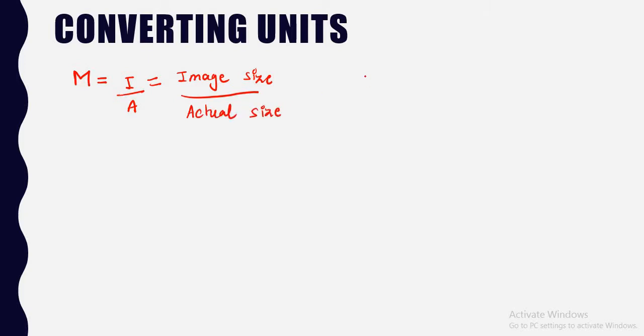How I ask my students to remember it is as IM, a simple way. And then you can rearrange it, like how we have rearranged for magnification. In a similar way you can rearrange for the actual size also. So IM is the simple way to remember the formula of magnification.